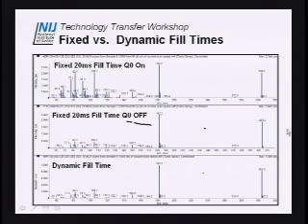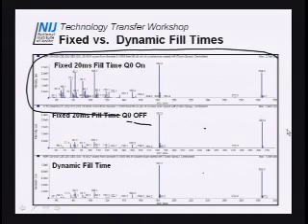We start at a collision energy of 10. We step to a collision energy of 25, and then we step to a collision energy of 55. And what you see is this pattern right here, which is what I matched to a library. The thing is, our library is built off us doing this for every compound, so that's how we can match it.